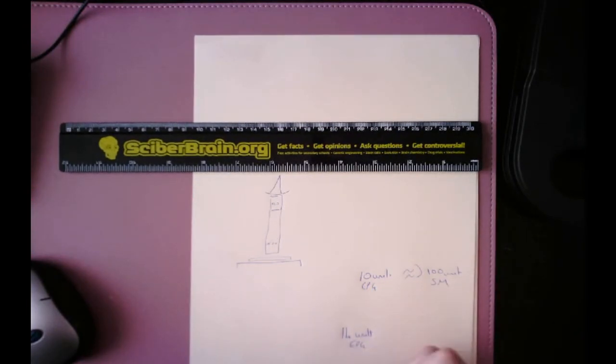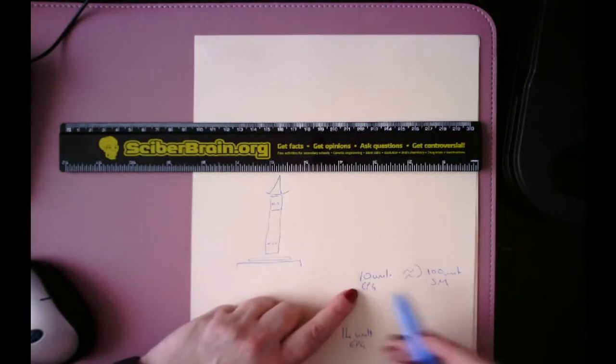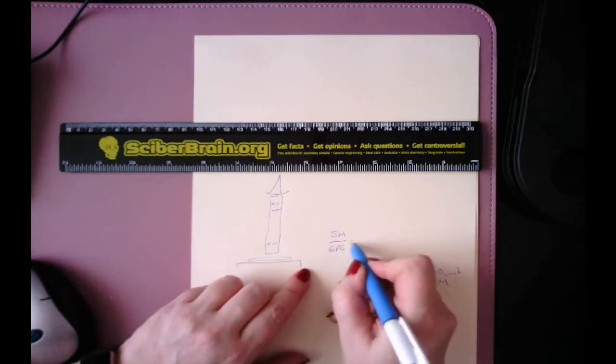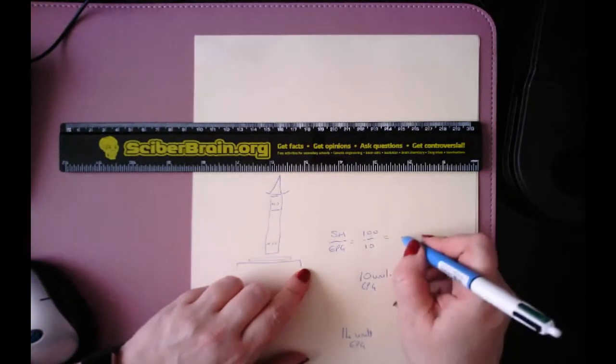Therefore, each eyepiece graticule division is going to be whatever's on the stage divided by the eyepiece graticule. In this case, it's going to be 100 divided by 10 equals 10.